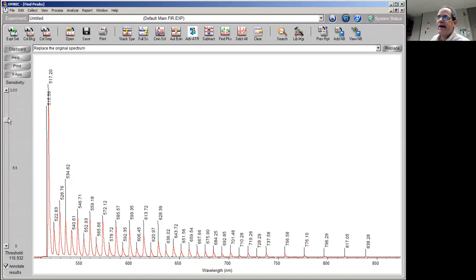It's not quite clear exactly what the best place is. But if we use this position, at least we know that if we throw away the first peak, all the rest should be valid. So let's try that.